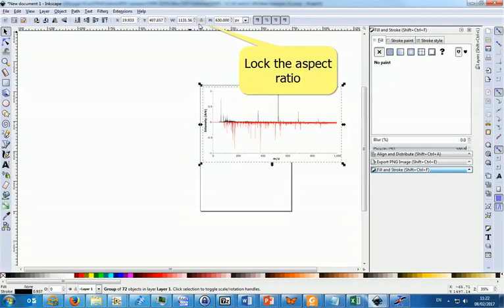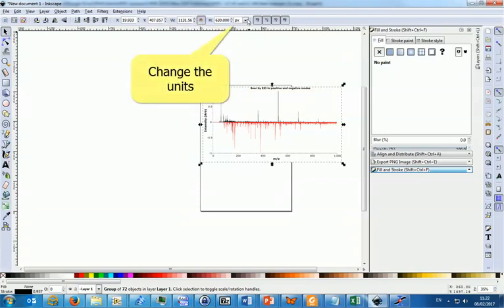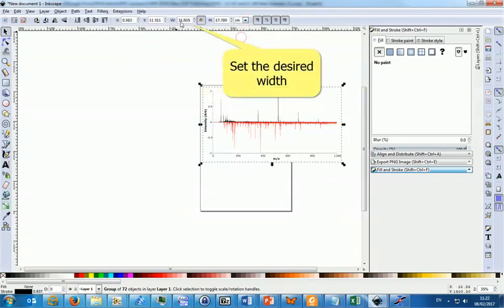We don't want the shape of the graph to change as we rescale it, so the first thing we have to do is lock the aspect ratio using this button. Now change the units from pixels to centimeters. Now we can set the width to exactly the width we wish. In this case we're going to set it to 15.4 centimeters.